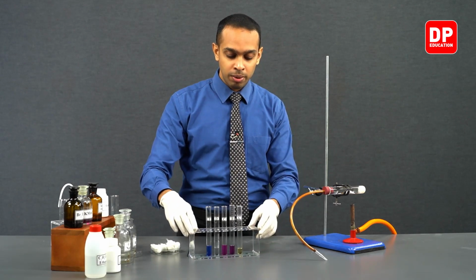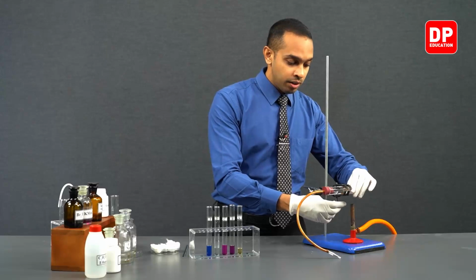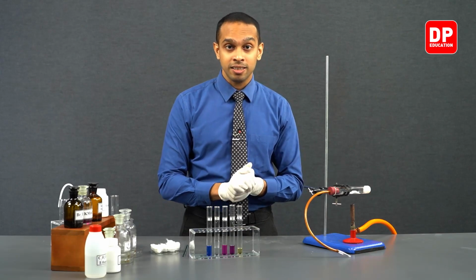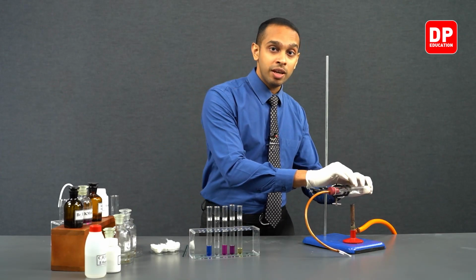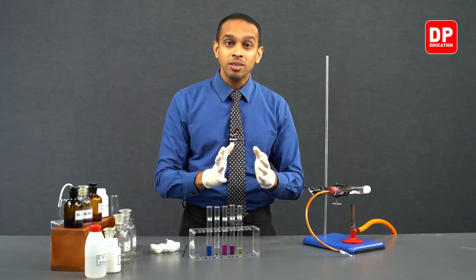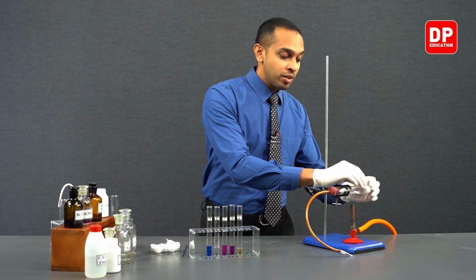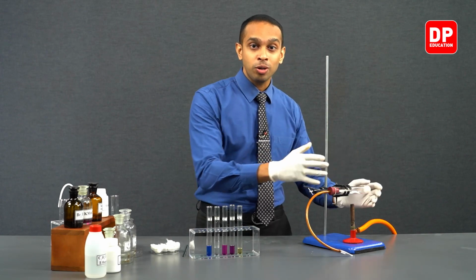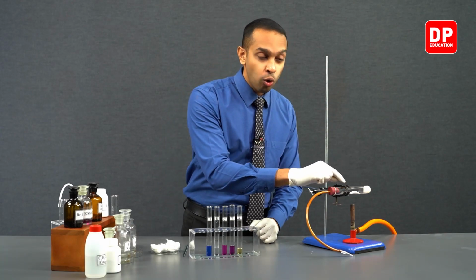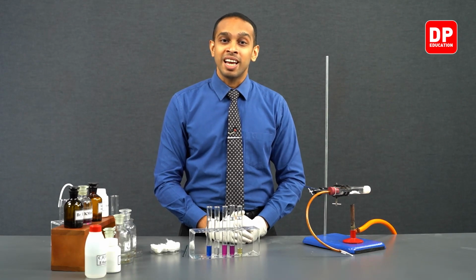So we have our test tubes labeled A to E here, and you know what compounds are there in these test tubes. We are now going to start our reaction by heating the alumina that we have here. As we provide heat, as you know, ethanol is a bit of a volatile organic compound. So the ethanol that we have soaked up into the cotton wool will evaporate, absorbing the heat, and will go over the heated alumina. This will produce ethene gas.